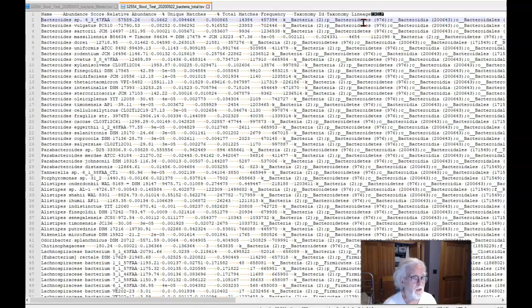Now the next thing is you go over to the microbiome site, and there will shortly be a new upload there to take the file up, and I'll show an example of the file on that page.